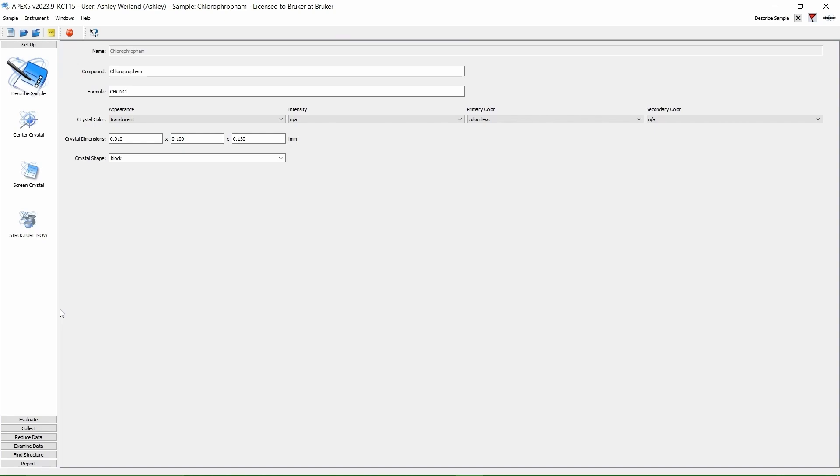Let's zoom in to my screen. After centering a crystal on the instrument, go to Describe Sample and input the relevant information about your material. Then go to Evaluate Determine Unit Cell.